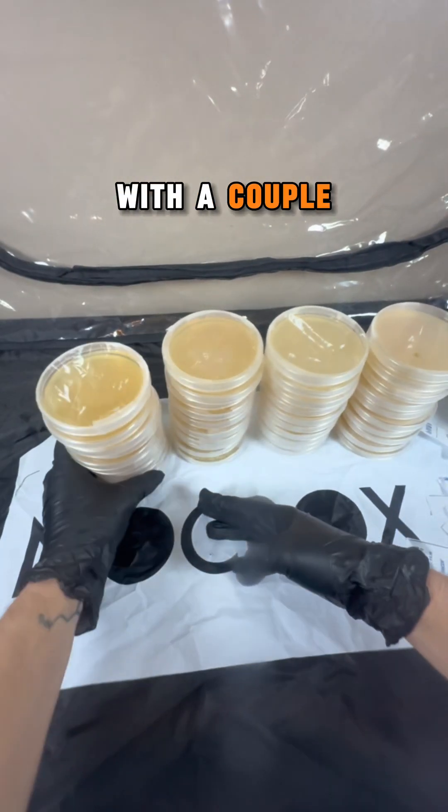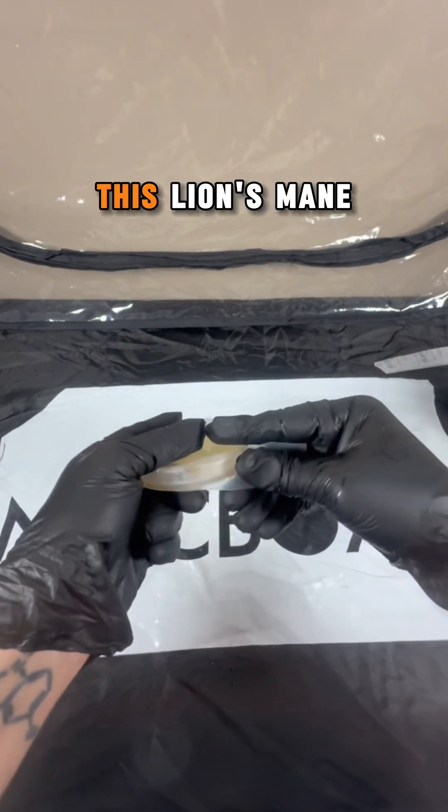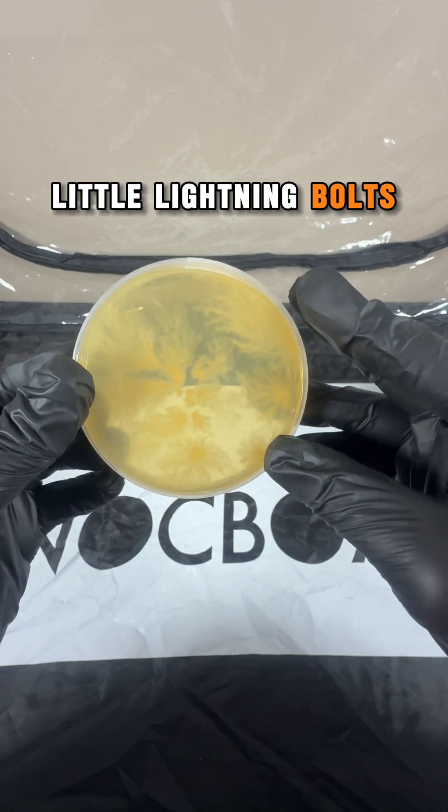After the agar plates are solidified, I wrap each one in parafilm. I incubate the plate for seven days to make sure it's clean, and then I inoculate it with a couple drops from my lion's mane mushroom liquid culture syringe. I'm amazed by the growth of this lion's mane mycelium on these super nutrient agar plates — I love how it looks like little lightning bolts.